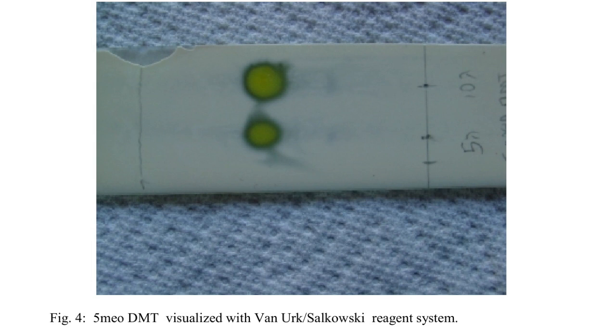Admittedly, this technique is best used by a practiced chemist, but once mastered, it can take reagent testing to a whole other level. It can even make it possible in some cases to identify common cutting agents. For example, this technique could easily distinguish real heroin from fentanyl. It could also identify if the drug was cut with something like xylazine.